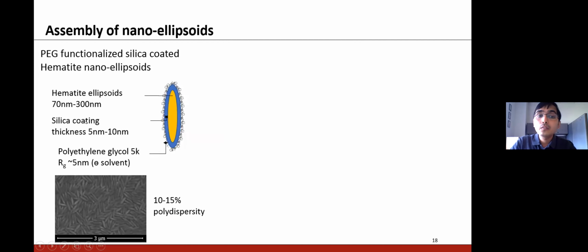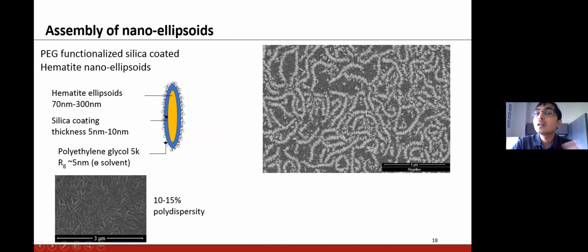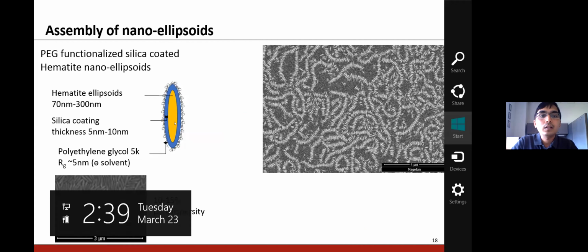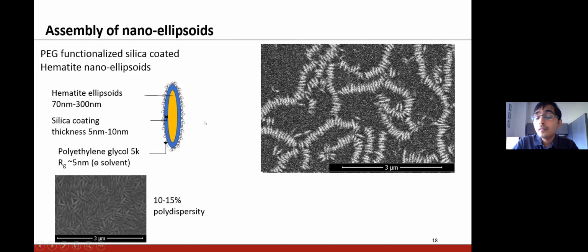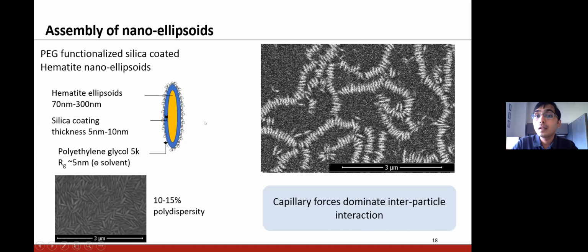So, and also when we do as a proof of concept, when we use particles which should have bigger capillary type of interactions, we again got much more pronounced interactions among the particles, and we could observe these stacks forming on the surface of the liquid. And here again we are getting very good contrast because we have a hematite core, which is the iron oxide phase, and when we look at the high magnification image, we notice again it's a directional assembly, and because particles are still in motion, we observe that these stacks are flexible, which is an important detail for us because it tells us that the interactions among the particles are weak, and that these stacks change their curvature with time but still remain intact.